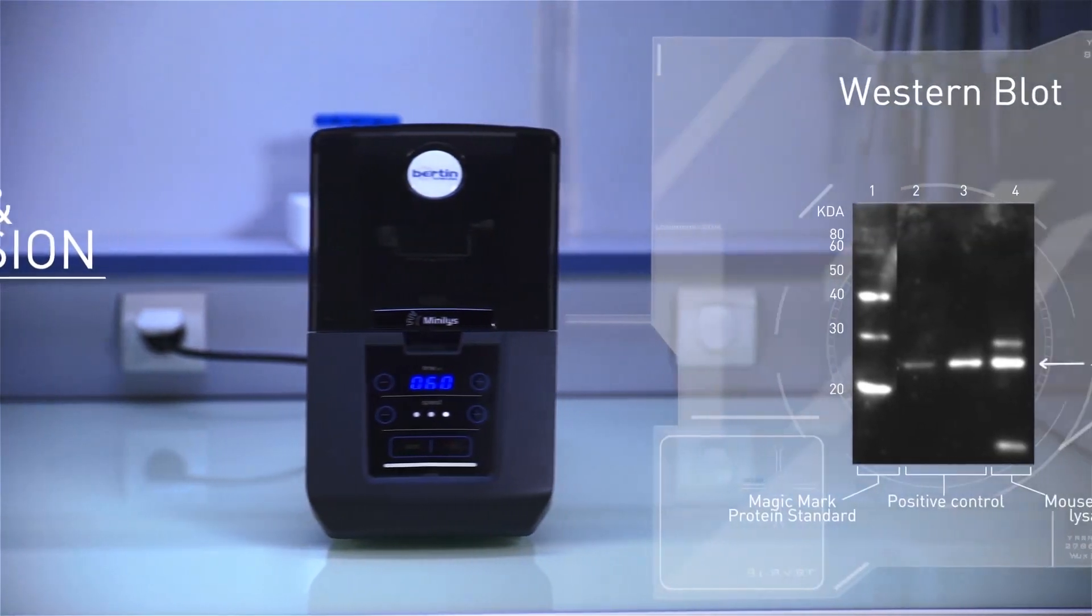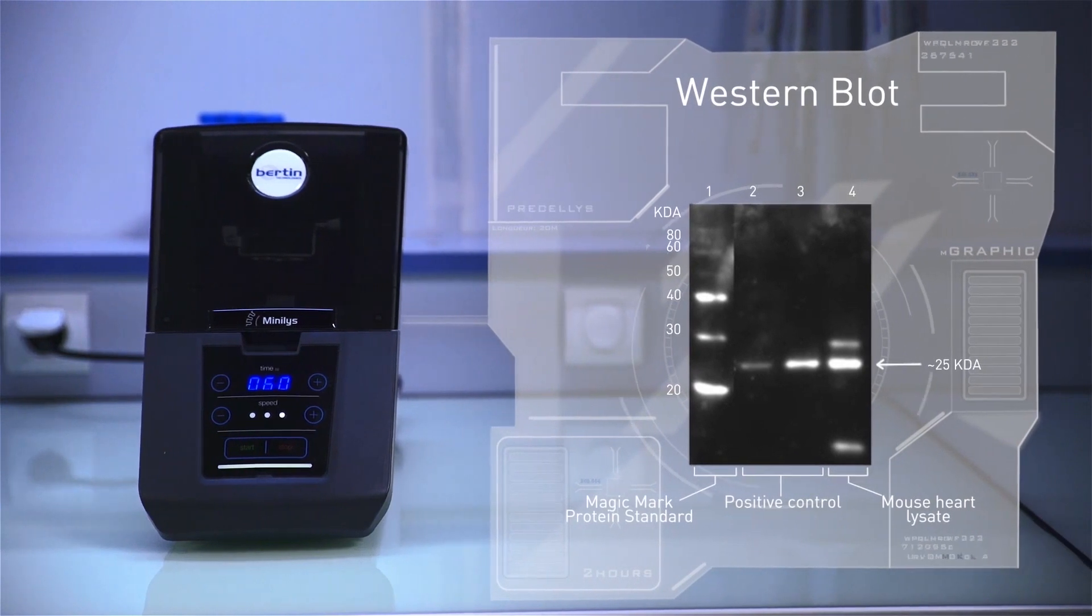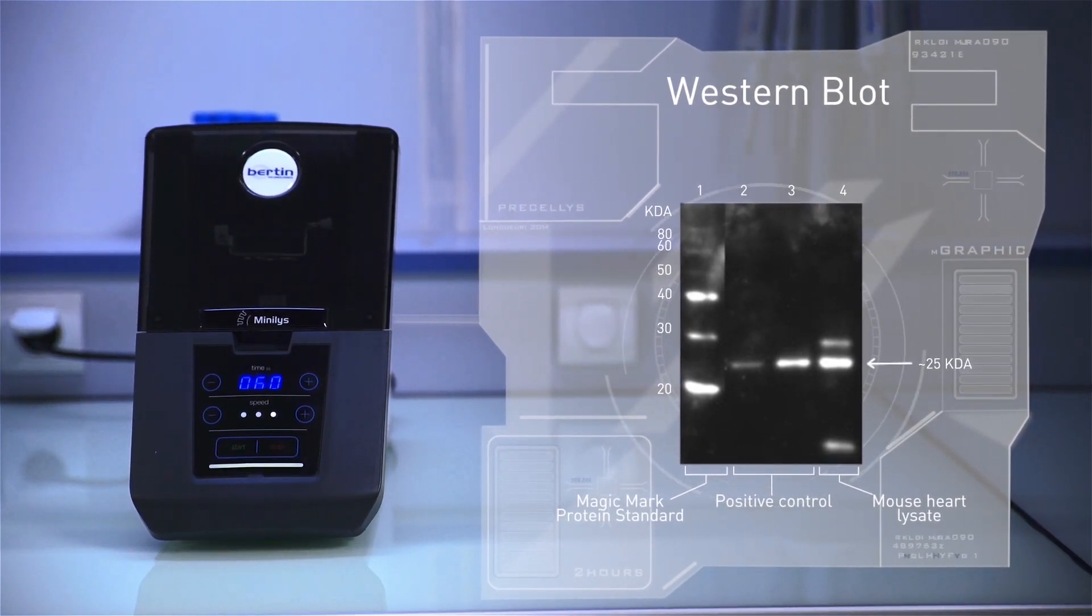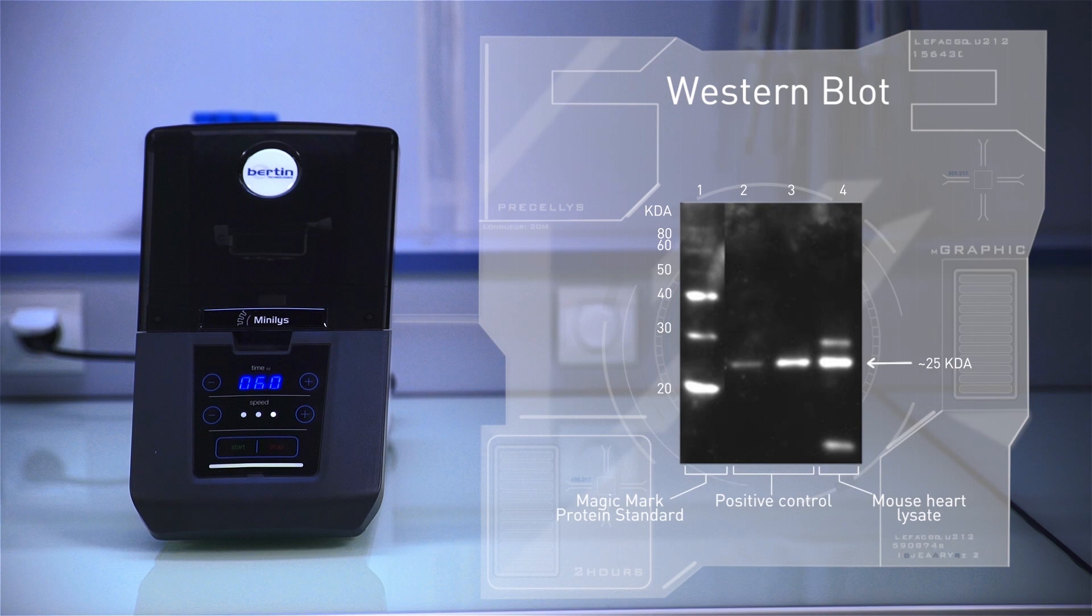HEK293 lysate, which serves as positive controls. Membrane proteins extracted using the MiniLys are run on lane 4. After Western blotting using an S1P3 polyclonal antibody, we observe the presence of clear, sharp bands representing S1P3 at 25 kilodaltons.